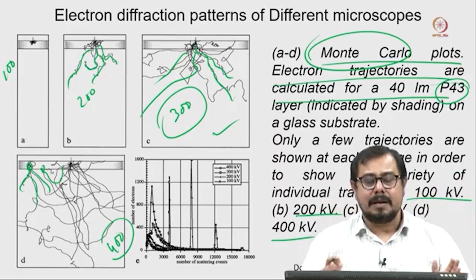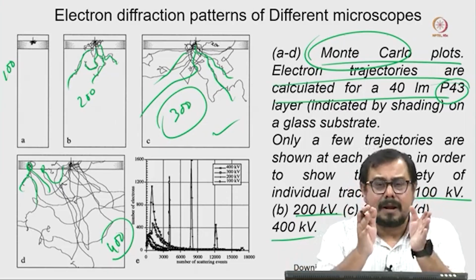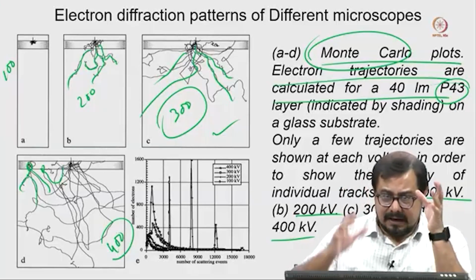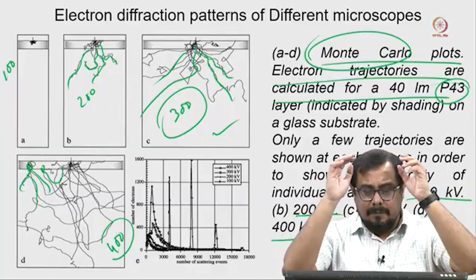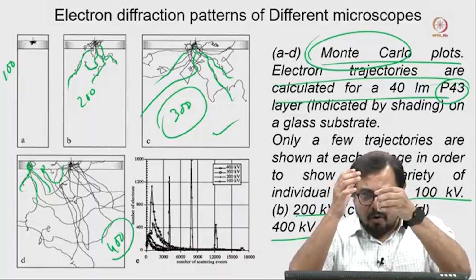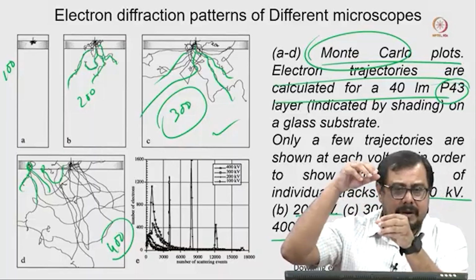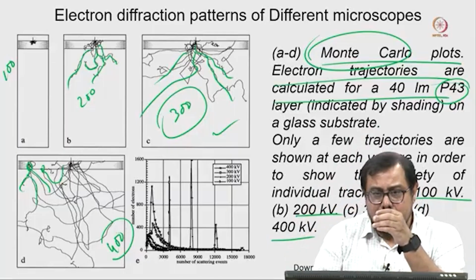And if you remember clearly, when we discussed cryo-electron microscopy, what we are doing, basically, is that we have a grid, and inside that grid we have a square. If we go inside that square, we will get a hole. There is amorphous ice and protein is embedded at different orientations. When the electron beam passes through, we will get a 2D image.